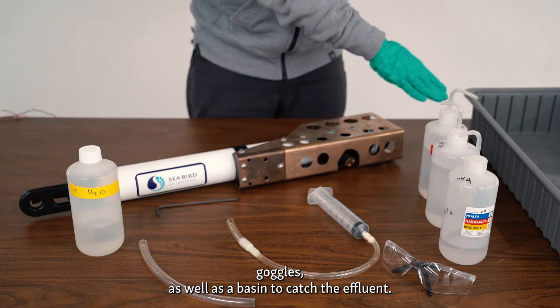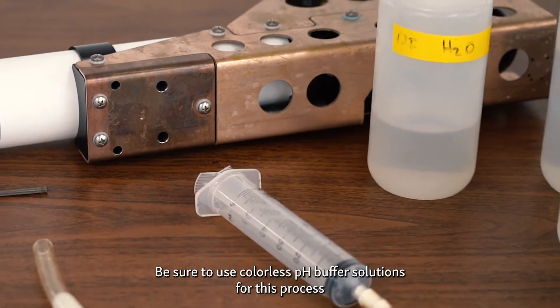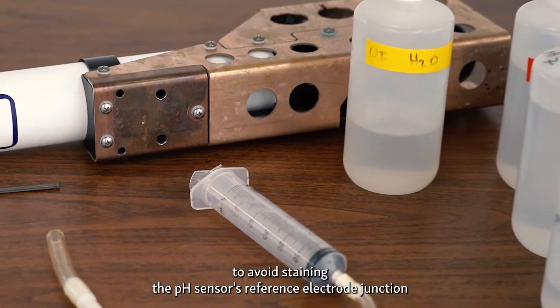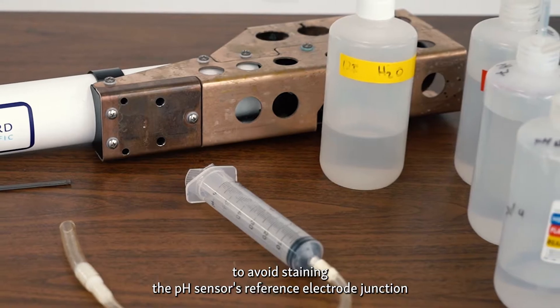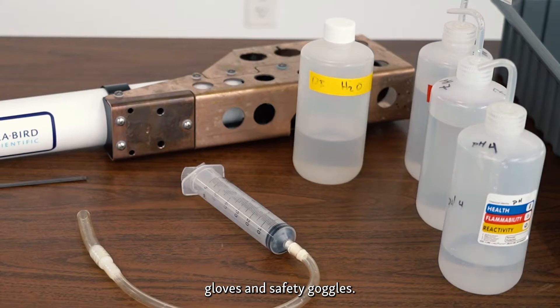You will also need a basin to catch the effluent. Be sure to use colorless pH buffer solutions for this process to avoid staining the reference electrode junction. And also wear the appropriate PPE — gloves and safety goggles.